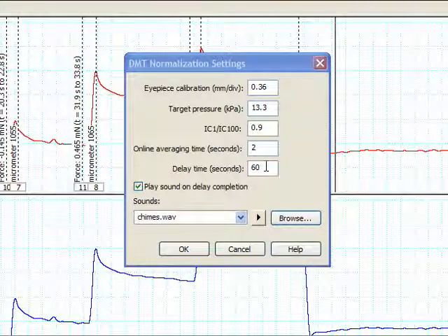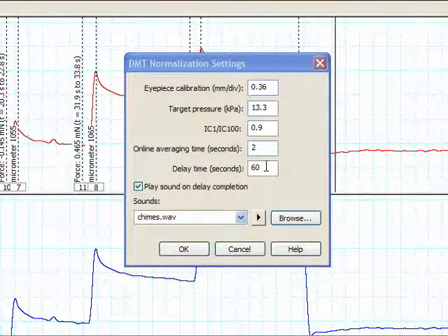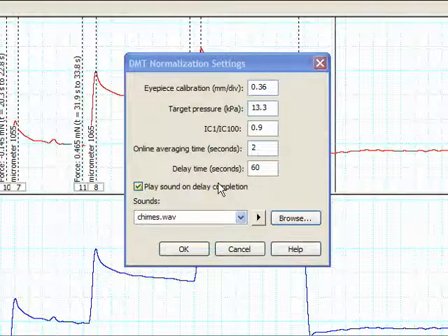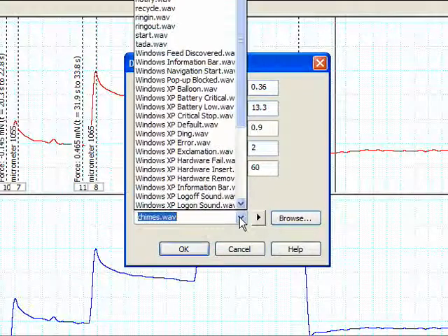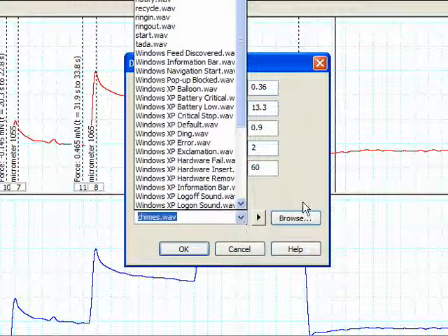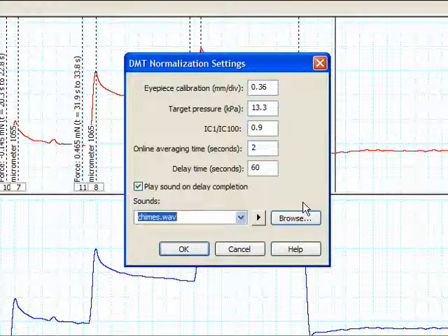The last option in the DMT normalization settings menu is to play a sound on delay completion. You can choose a sound from the sounds drop down menu or by clicking the browse button.